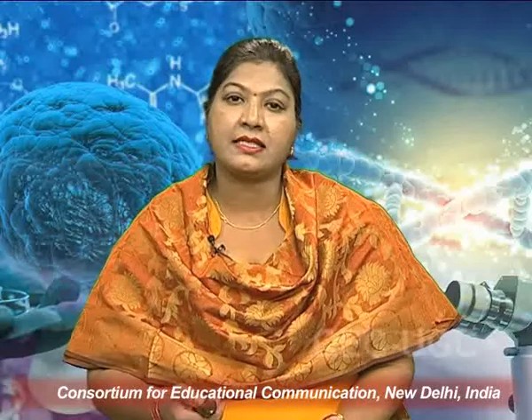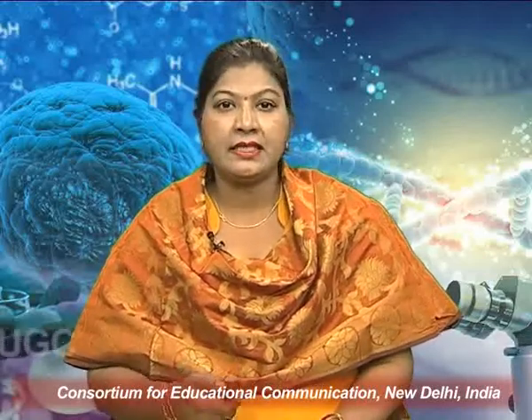It means by using atomic forces, we can scan the surface by interacting the tip and the sample. The force is changing, and the tip, which is attached to the cantilever, can vibrate. So atomic force microscopy gives the imaging of the sample by interaction with the probe.